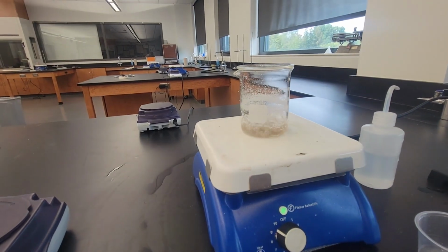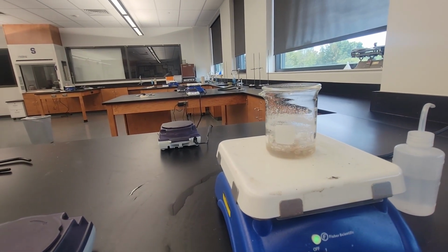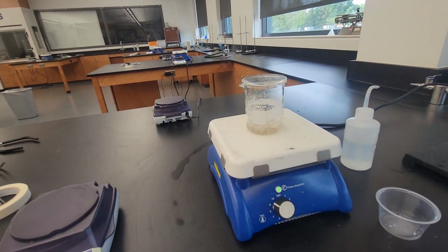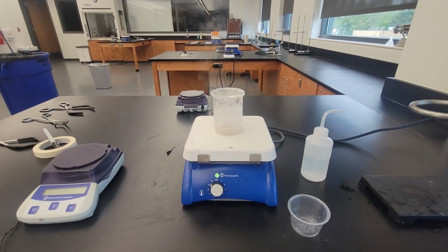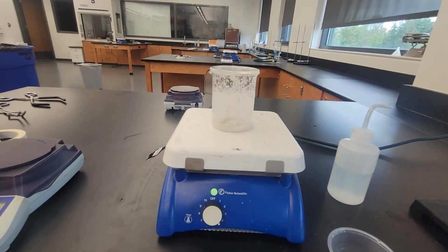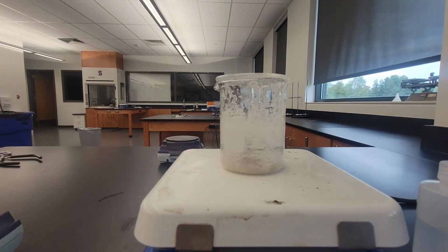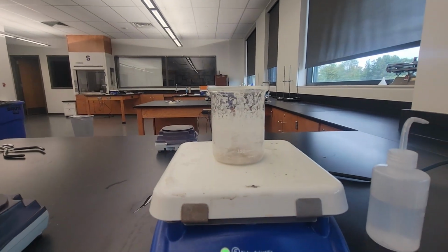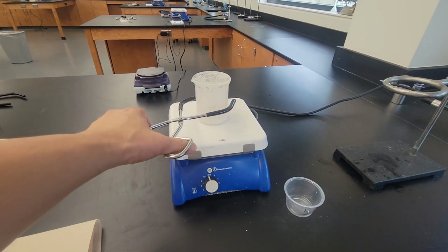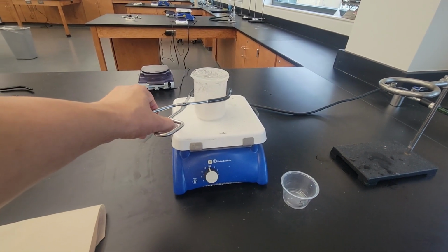So not much longer now. All right, let's turn this down. It is almost there. All right, turned off the heat. I'm going to let this cool.